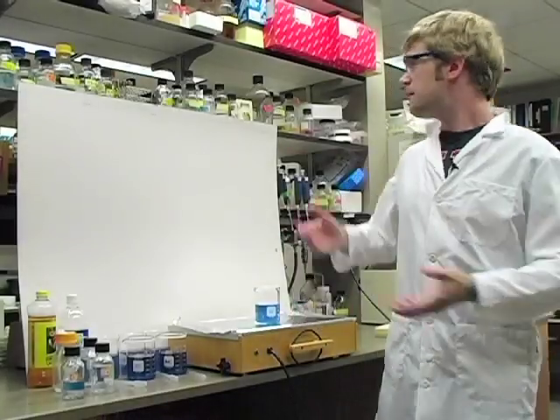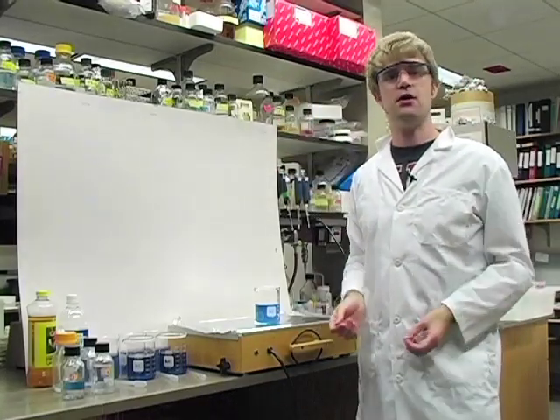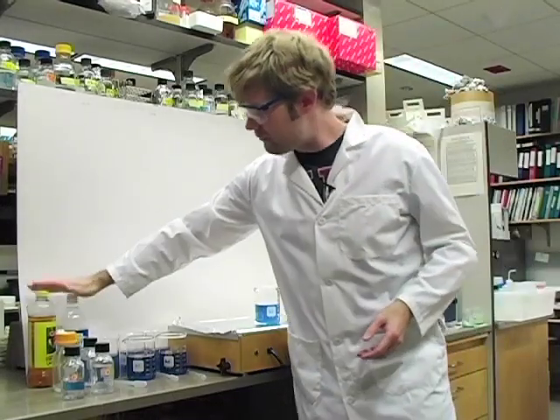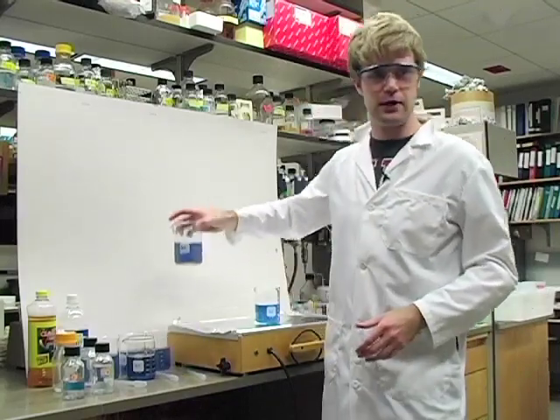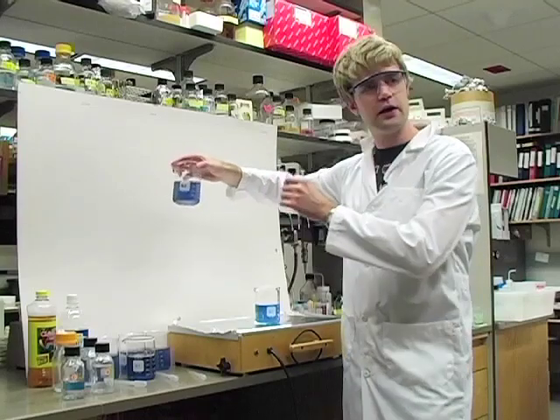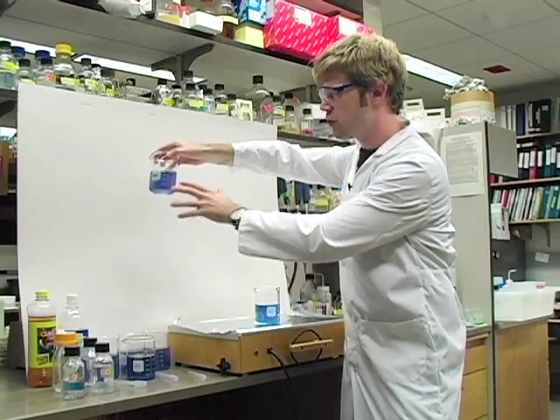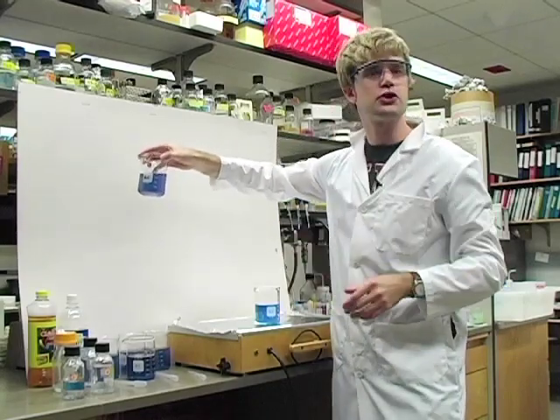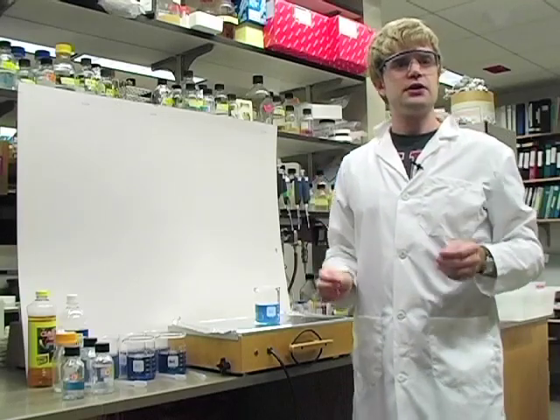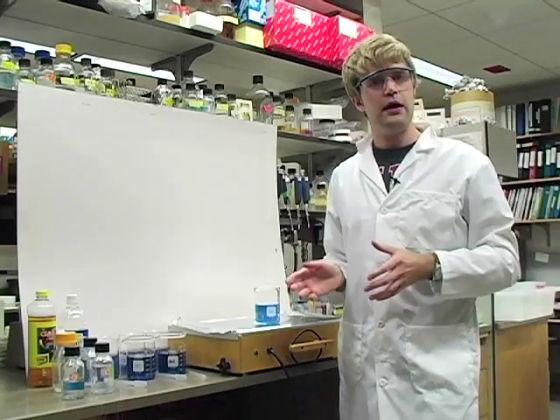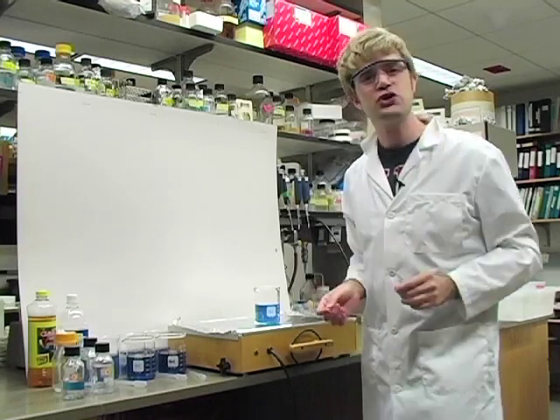Welcome to my lab. This is where I have all my chemicals that I use for science experiments every day. I also brought a few of these chemicals from home. I have a bunch of beakers here, and I filled them with a liquid called indicator. You can see that this indicator has sort of a blue-purplish color, and that's going to be important. Indicator tells us whether a chemical is acid, base, or neutral.